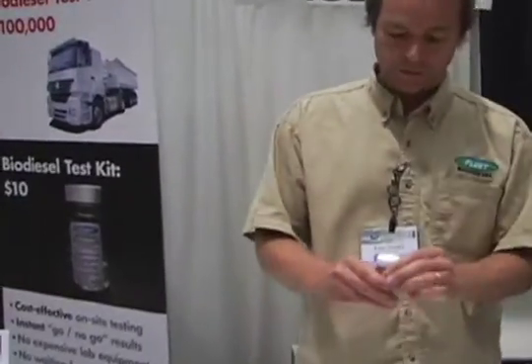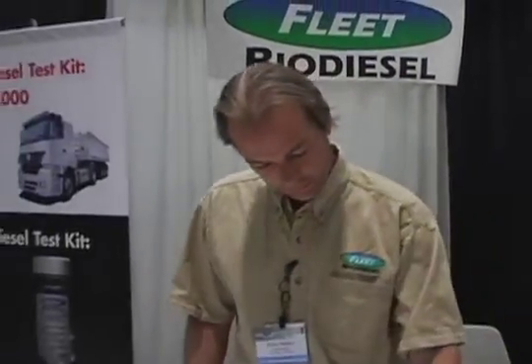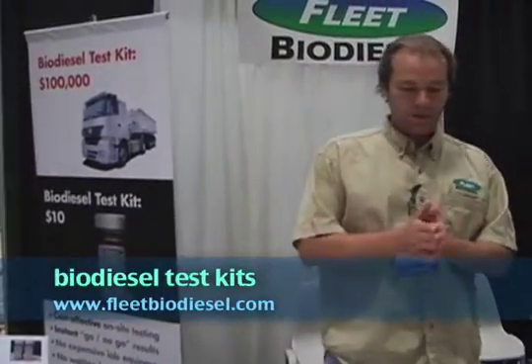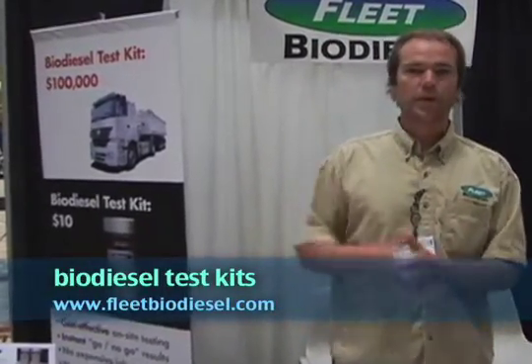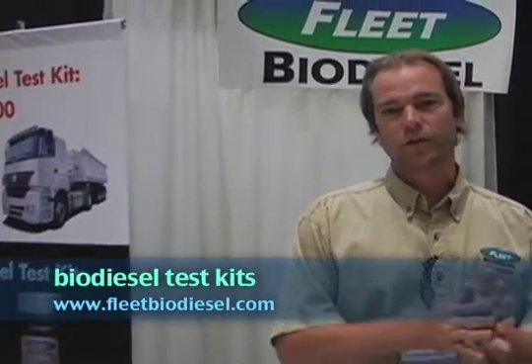If it's bad, like this fuel, they shake it up and it turns yellow just like that. So that's an indication that the fuel quality has exceeded a level — it should start to be a concern. All of our tests are designed with that in mind, to just alert people before the problem gets out of hand. We want them to keep using the fuel and not hurt their trucks.